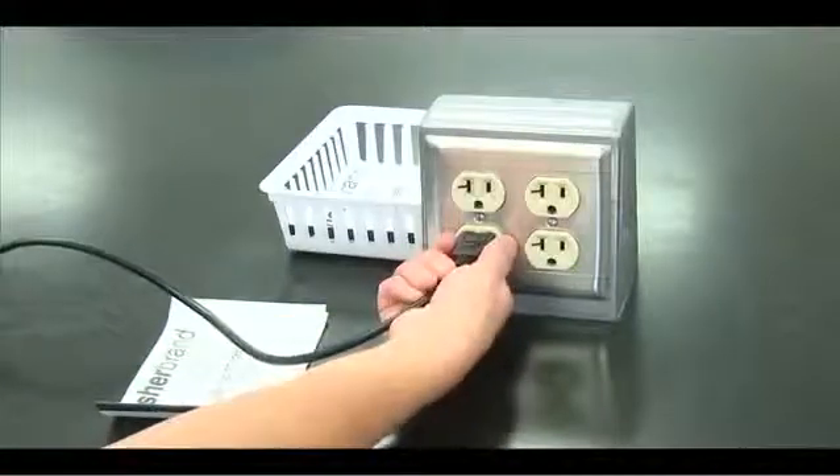Unplug the microscope by the plug and wrap it into the cord holder — never pull on the cord to disconnect. Cover the scope. Hold it by the arm and the base, and put it in the cabinet with the arm facing out. Be careful not to hit any microscope parts when replacing the microscope.